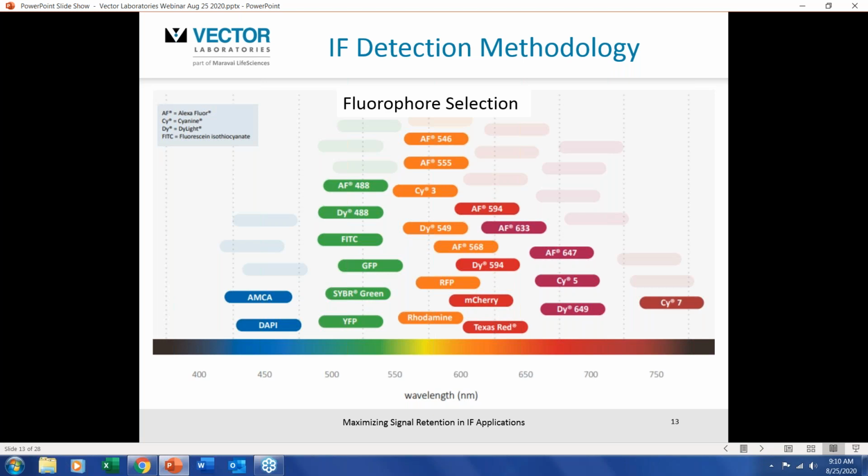So for investigators who are looking for a single stain, single fluorescent label for an antigen, you couldn't go too far wrong in selecting one of these particular fluorophores that I've got labeled here. This is not an extensive list by any means. It's just some of the more popular ones that investigators use and publish on out there. And certainly just to break it down a little bit, obviously these would fluoresce in green, these orange ones in orange, red, and then far red if you are working on confocal.